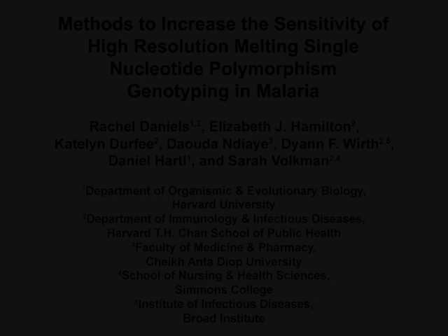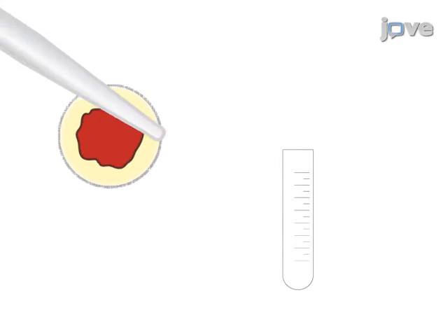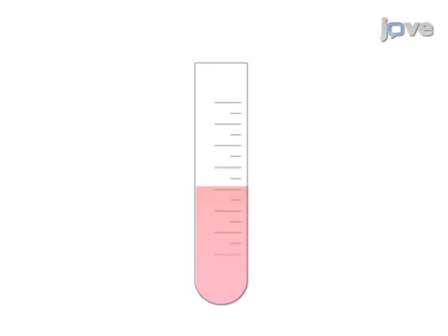The overall goal of the following high-resolution MELT experiment is to increase the sensitivity of detection of mutant alleles present at low concentrations within individual samples. This is accomplished by first preparing extracted DNA by diluting the template to the necessary volumes and concentrations.